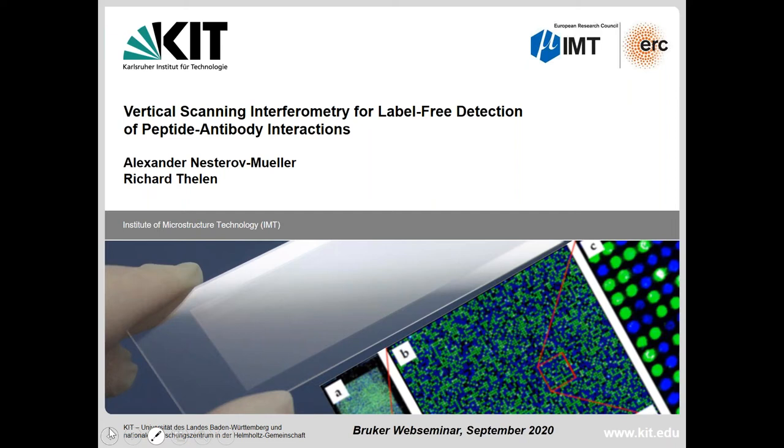Hello Samuel, thank you very much for a very nice presentation, and many thanks to Bruker for the organization of this webinar. As said in this presentation, we will speak about the Bruker optical profilometer to detect peptide-antibody interactions.